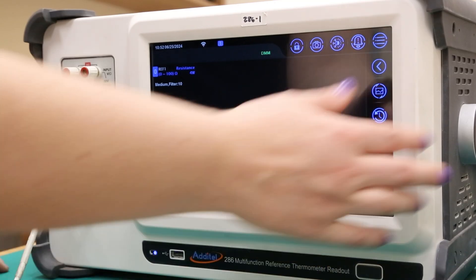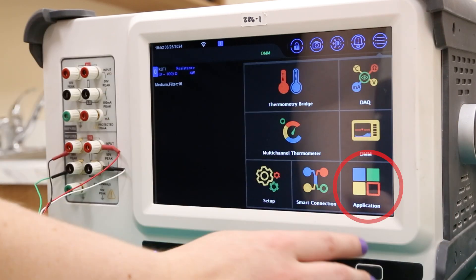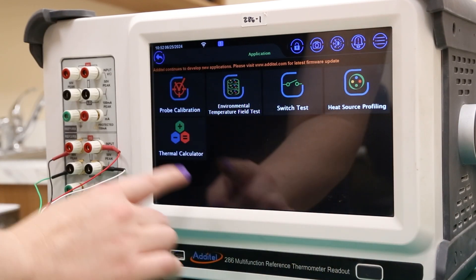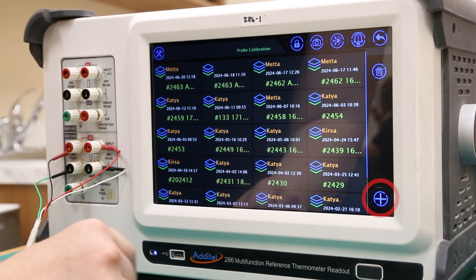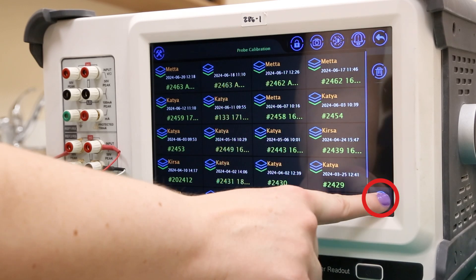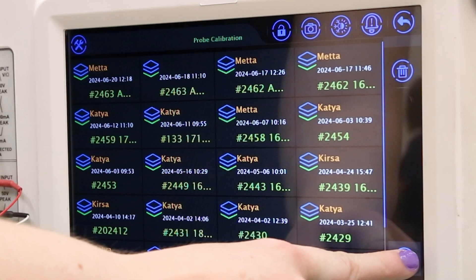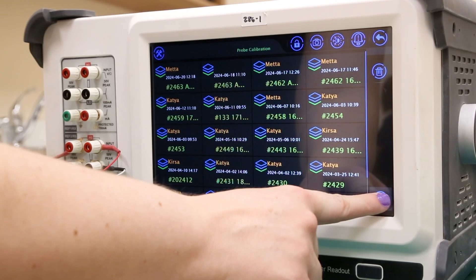Now we will set up the calibration test. From the 286 menu screen, select the application button, then probe calibration. Select the plus icon in the bottom right corner to add a new test. These tests are saved locally on the 286 and can be revisited at any point in the future.